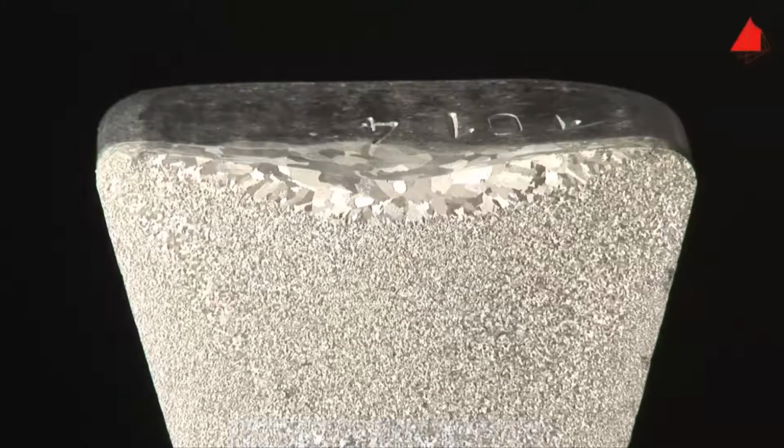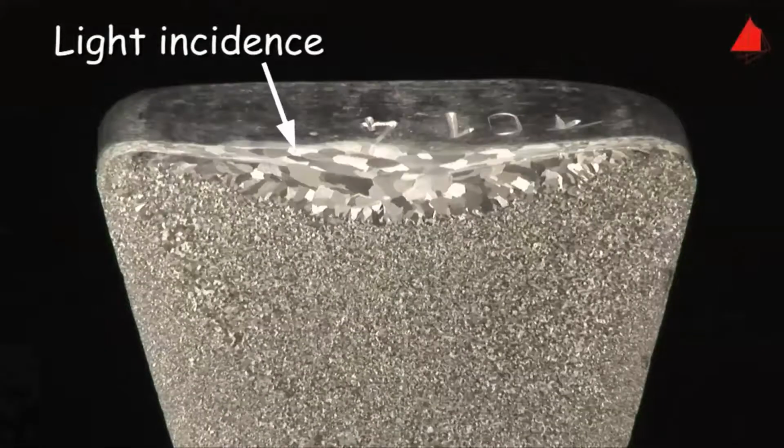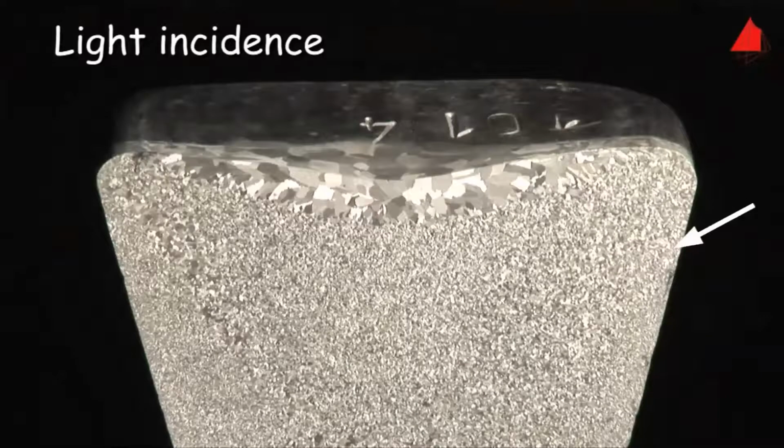comparatively small. They are hardly visible with the naked eye, but in the upper part, large individual grains may clearly be distinguished. But why are the grains only visible after etching? The reason for this is that the etchant structures the material grains on the surface according to their crystal orientation. Experts call it grain contrast etching. At lateral illumination, the individually structured grains reflect the light in different directions, and the grains become visible.